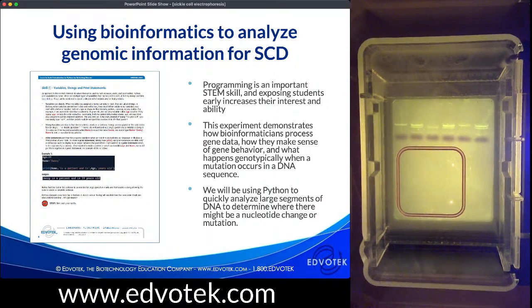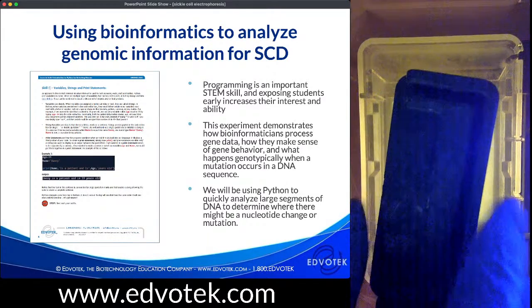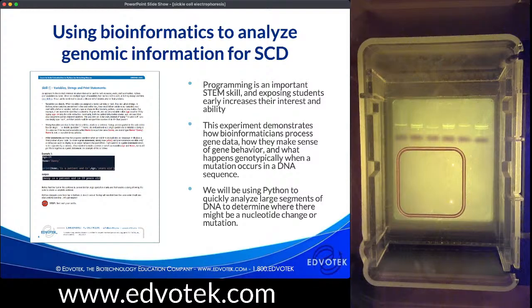One thing I do love about the EDGE is that the wells are the same size. You get the same casting tray and combs with the EDGE that you do with the M36 and our other electrophoresis chambers. The only real difference is that the EDGE casting tray has little fins on it, which keep it better anchored. But most of the casting equipment is actually swappable between systems. So it could be an additional unit that you use if you have research students doing different projects and you don't want to pull out the entire M36 for that. Hopefully that answered your question. If not, please put more info into the chat and I will answer.